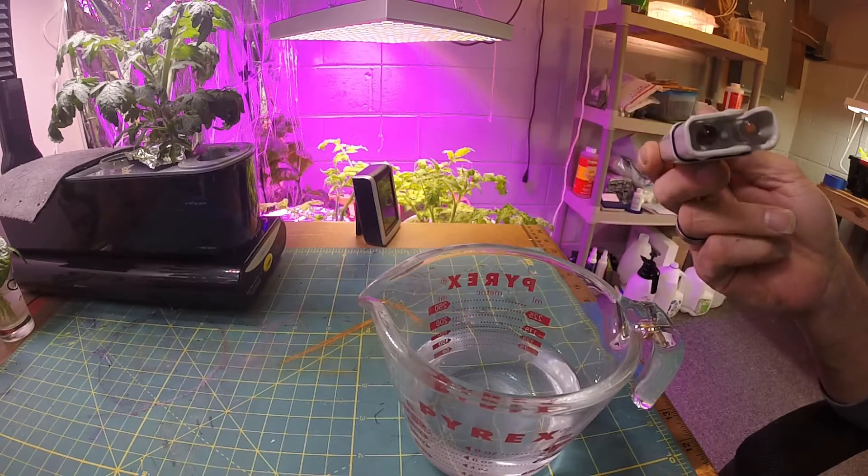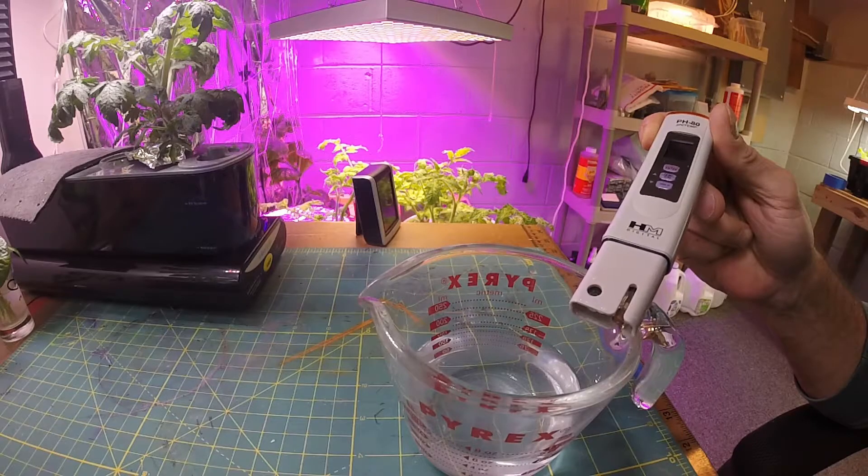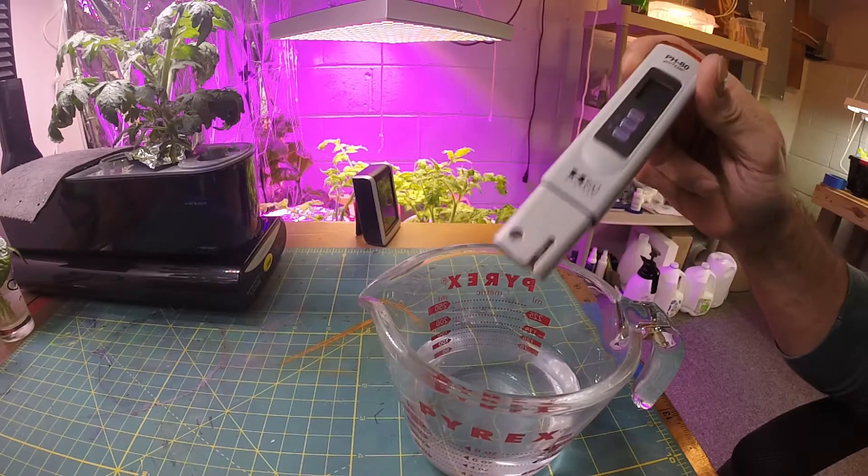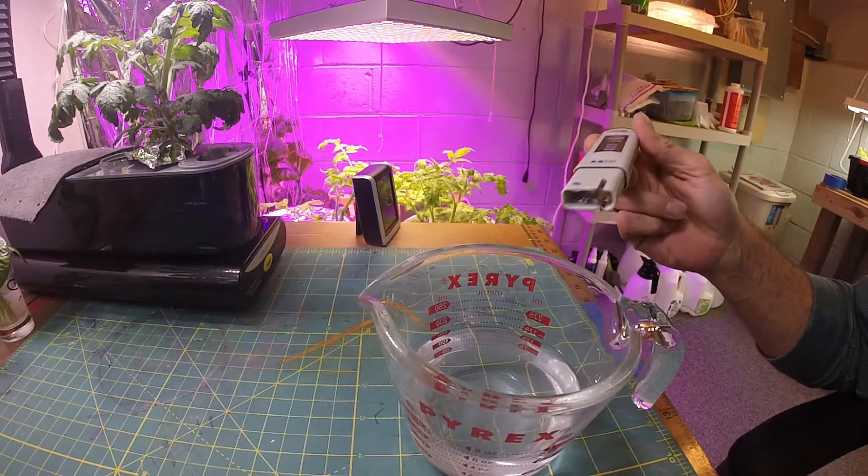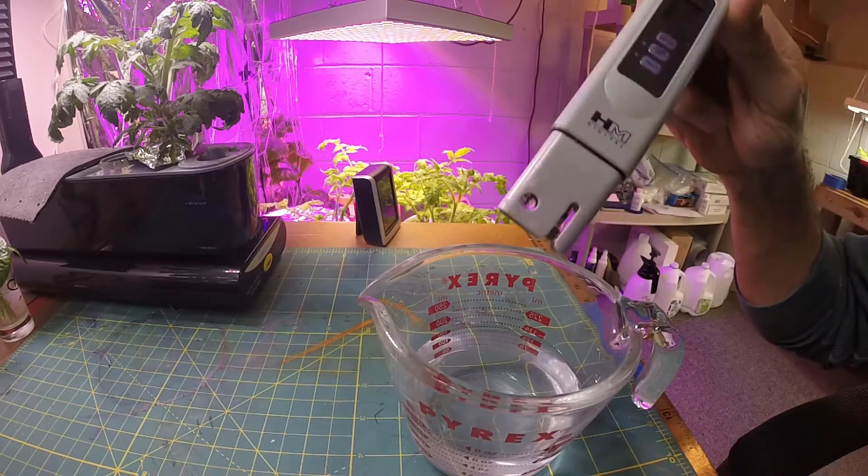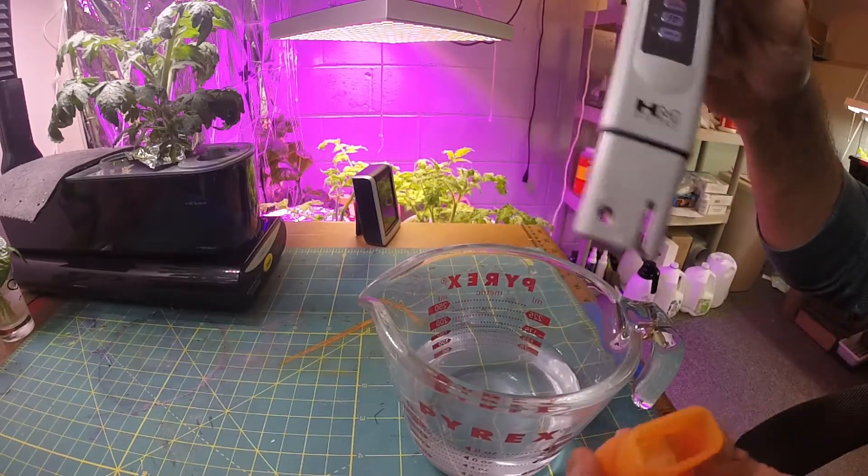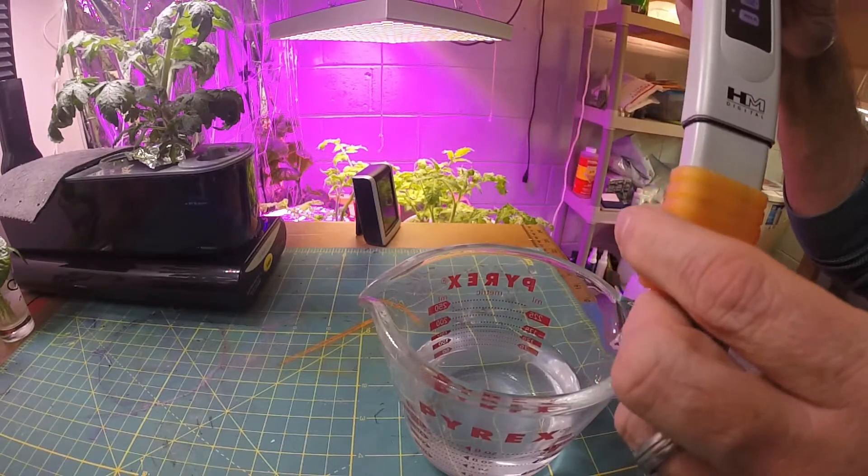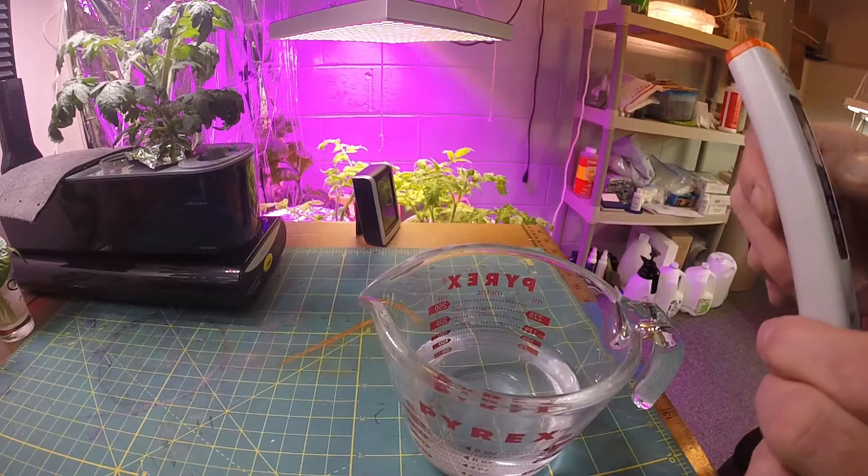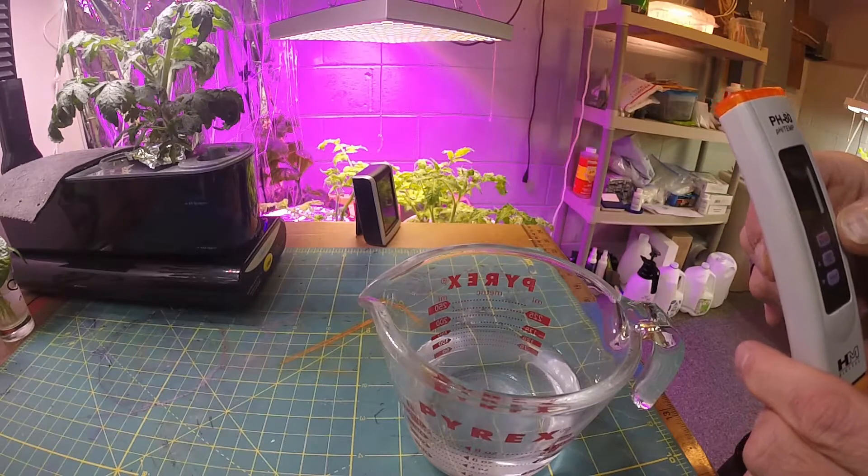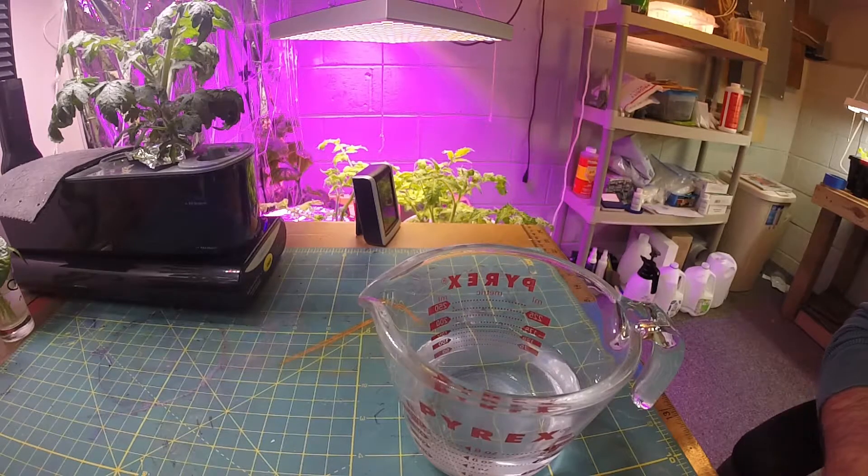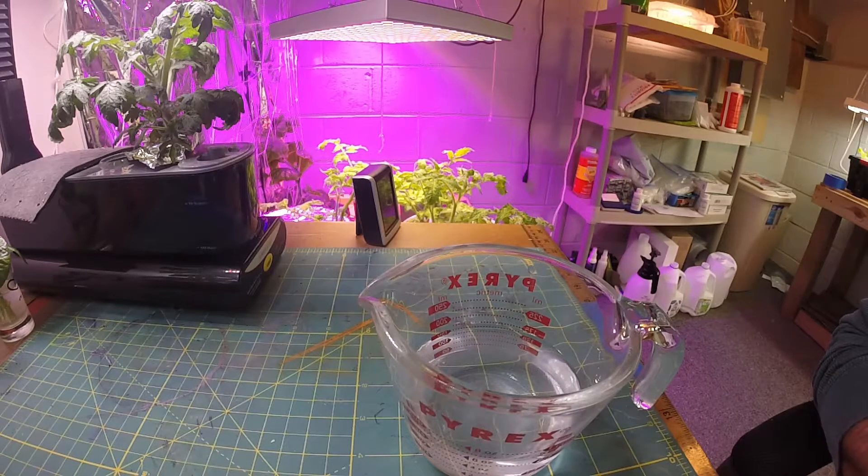All right, so then you're supposed to rinse this off. You can clean this in the buffer solution. I guess you really wouldn't have to clean this off right now because I didn't actually put it in anything with nutrients or anything, but basically what I'll do is rinse it off in the buffer solution. And then this will go right back into the cap which has that foam in the bottom, and I'll power that off. Okay, so I just wanted to quickly show you the meter, check the calibration and stuff.